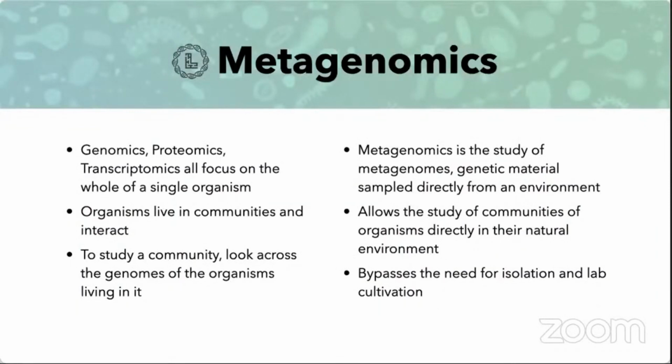So the term metagenomics covers all of these studies and refers to both the research technique and also the research field. The field can be defined as the genomic analysis of the microbial DNA from these environmental communities that we discussed, and the tools used to study these analyses enable us to make population analysis of previously unknown, unculturable or uncharacterized microbes or bacteria in general. This is very, very important in the current scenario because only around 1 to 2% of the bacteria can be cultured and grown and studied in the laboratory.